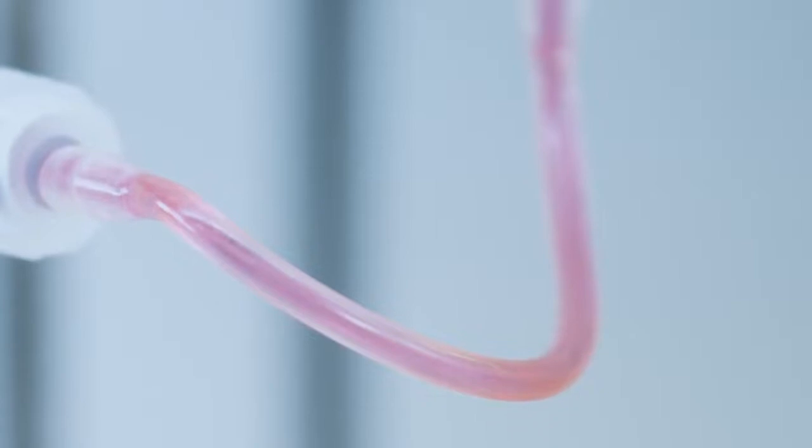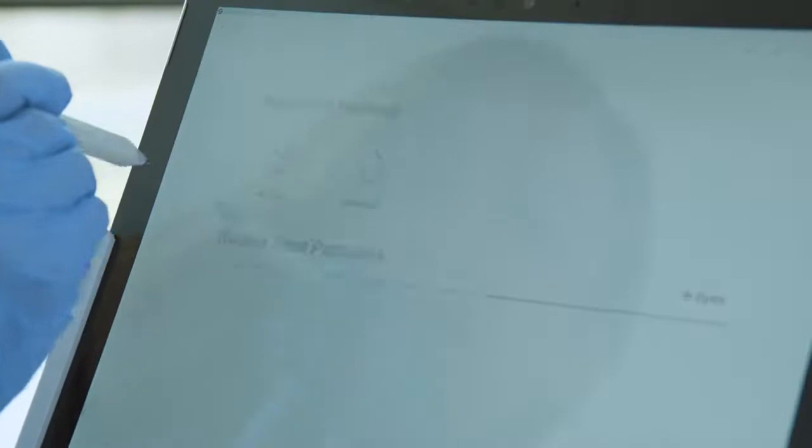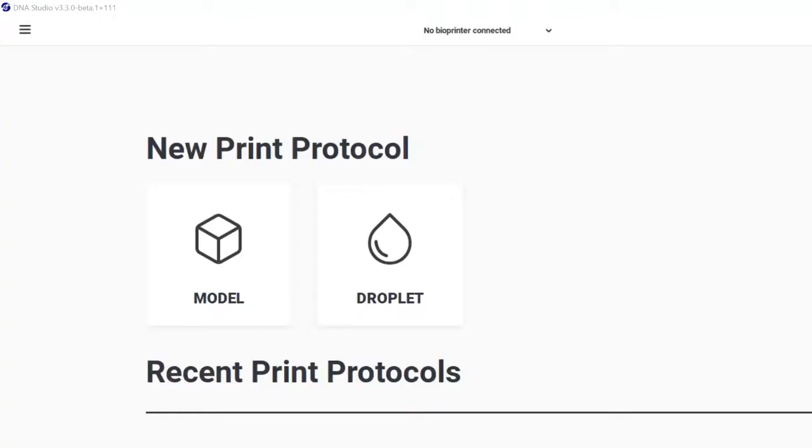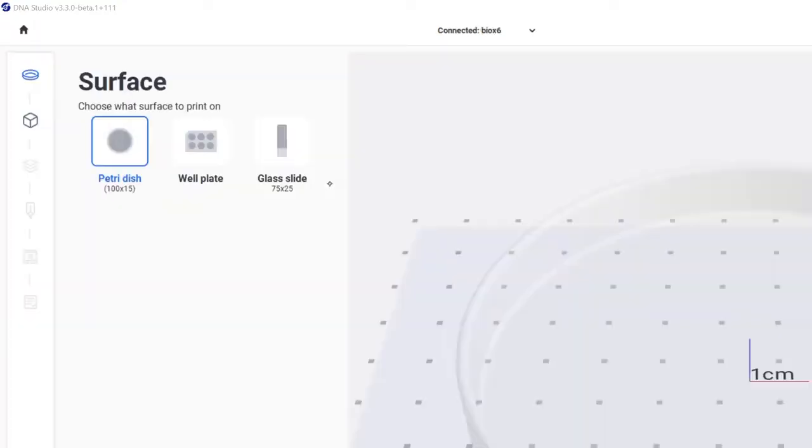Okay, let's go through the bioprinting settings. Open the DNA studio. From here the software gets connected to the device. You can select the specific plate that you are going to print. So I'm selecting the petri dish.